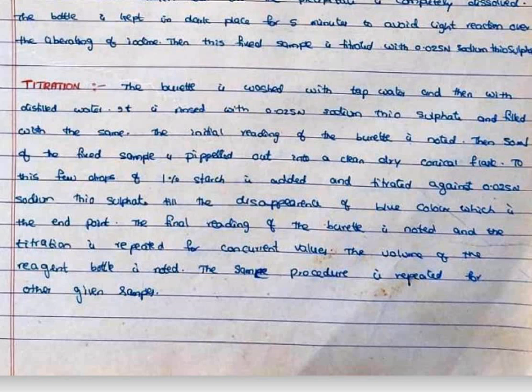The final reading of the burette is noted and the titration is repeated for concordant values.